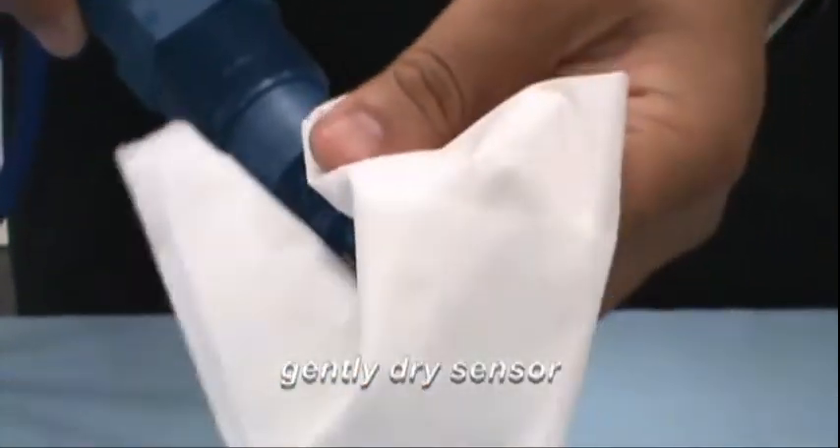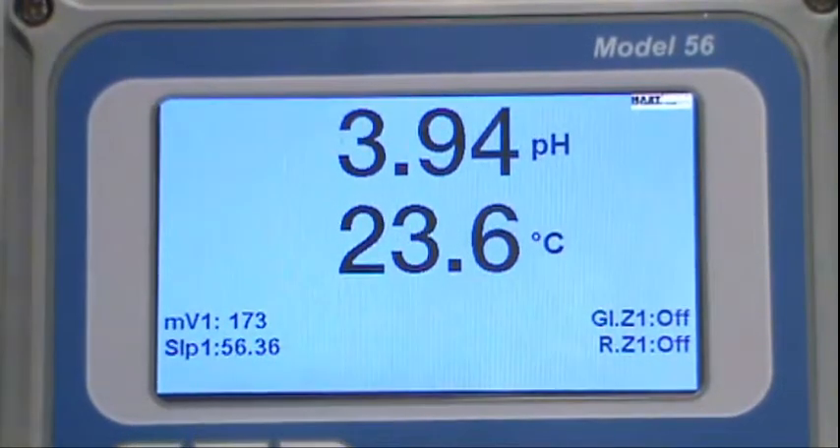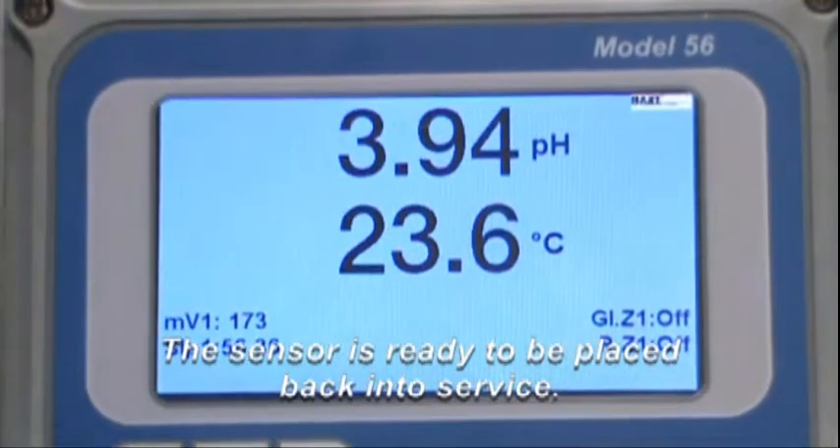Pad the sensor dry with a soft cloth or tissue. If the sensor is calibrated successfully, the instrument will not display any error messages. The sensor can now be placed back into service. And that's how you calibrate a pH sensor.